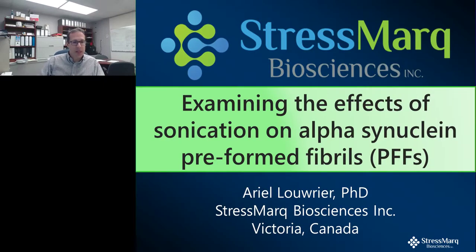I'm the CEO and president of a research reagent company called StressMarq Biosciences, and we specialize in making tools for neurodegenerative disorders. And today, my talk is going to be about looking at the effects of sonication on alpha-synuclein preformed fibrils, which are one of the primary resources that we use in order to create some of the models that are required for this type of research.